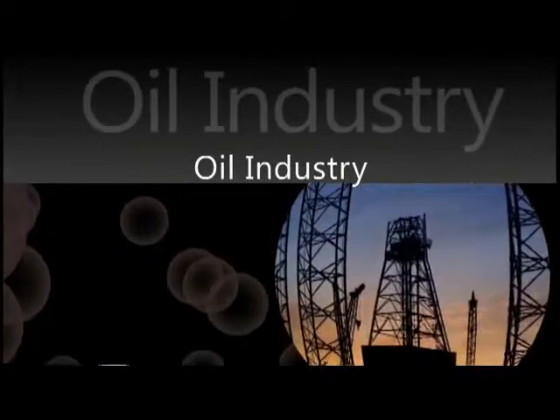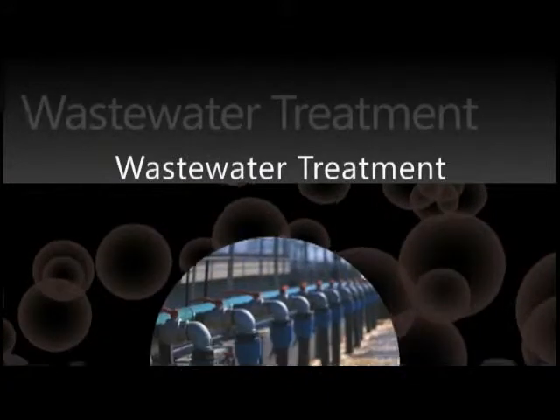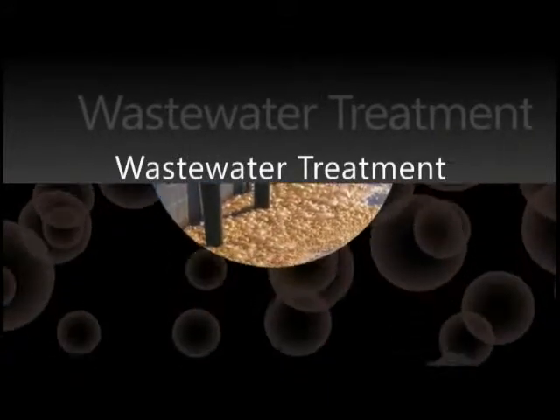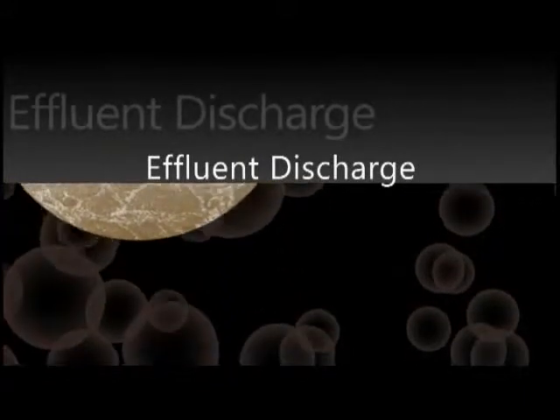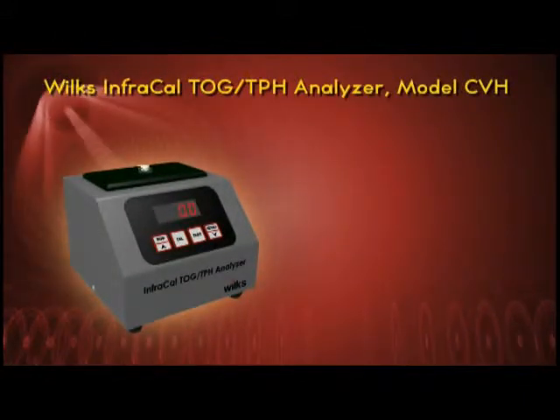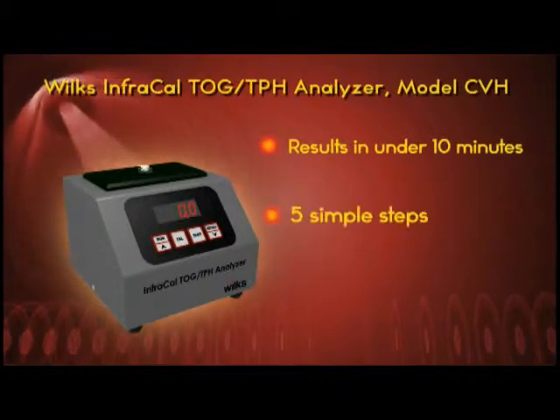Whether you work in the oil industry, offshore or onshore, are a wastewater treatment professional, or employed by a company that must regulate the amount of oil or grease in its effluent discharge, the Wilkes InfraCal TOG TPH Analyzer will give you the measurement results you need in under 10 minutes, with just five simple steps.